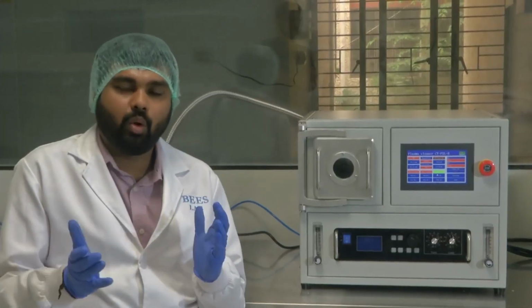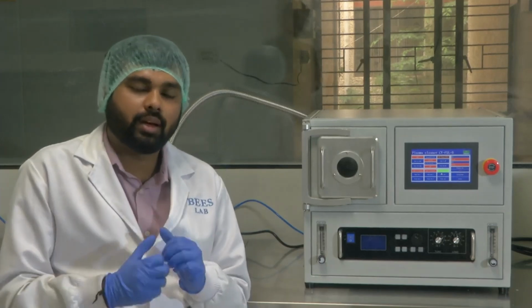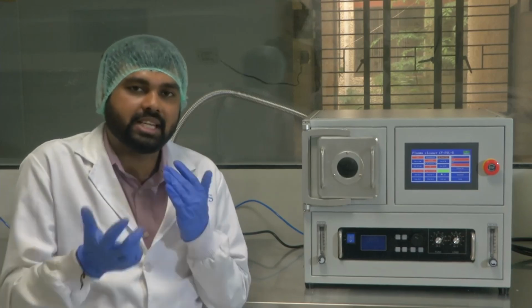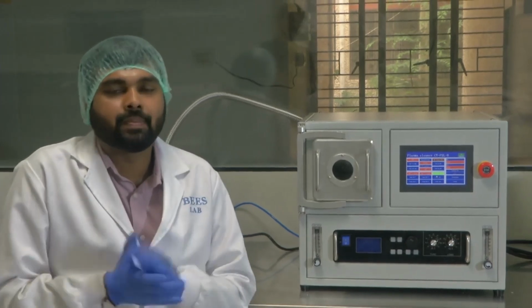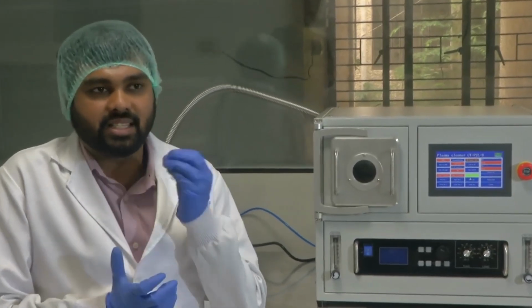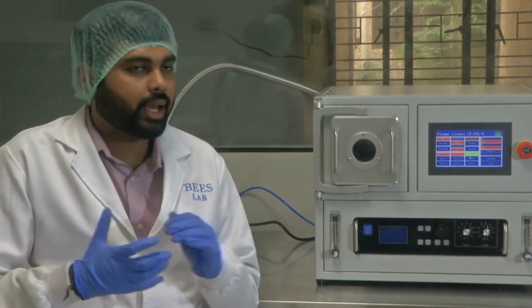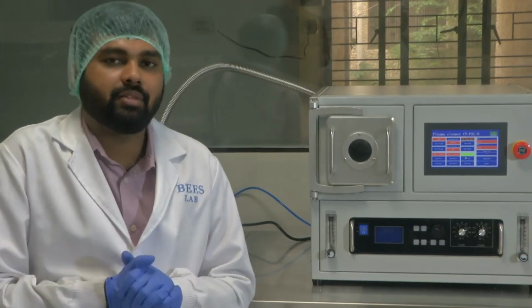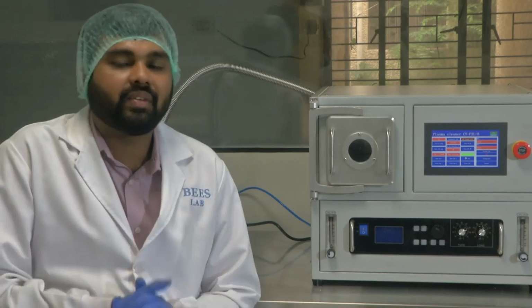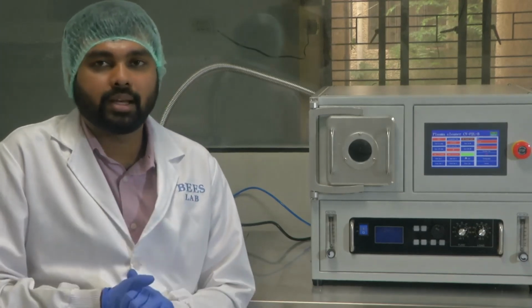I hope you found this tool to be quite resourceful and you understood the various uses of this tool and how it forms an integral part of the microfabrication sensors and actuators course, and how it is important for developing systems that sense physical changes in phenomena. You can go over the video again, understand the concepts that we have discussed while trying to understand how a real world system works. We have even looked at how we were installing it, what are the individual components of the system, how each component is important.